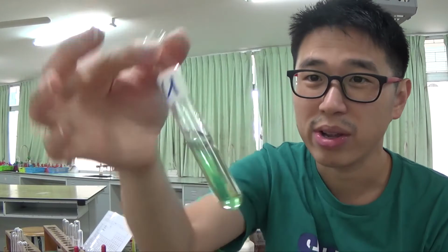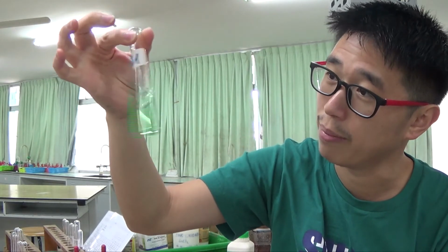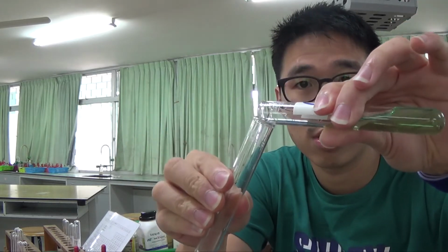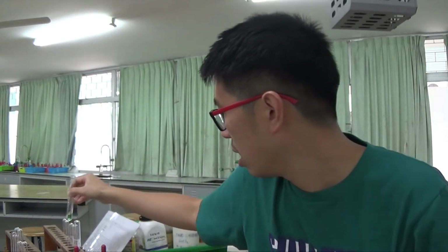Remember the iron 2 plus as an aqueous solution, it was never going to be this green, okay? Even though I use a lot of that solid just now, it was never going to be as green as this, even though I use only a very little amount of the green thing, okay? So these are different shades of green. I'm going to separate them into different portions, okay?